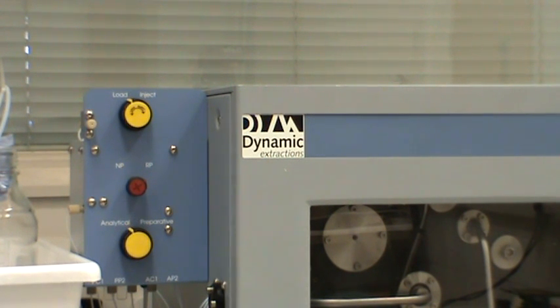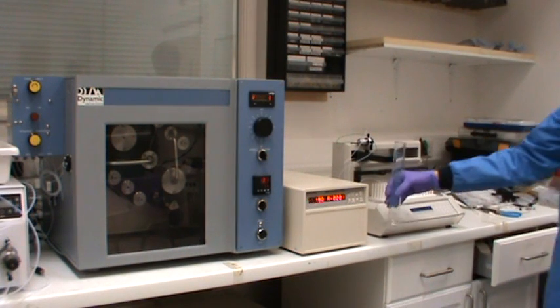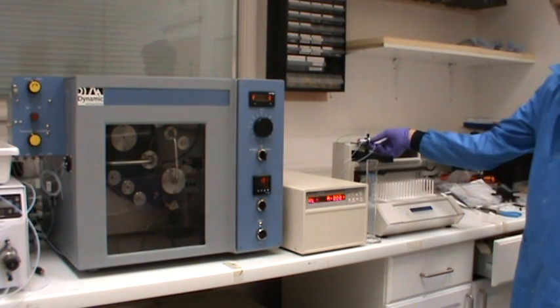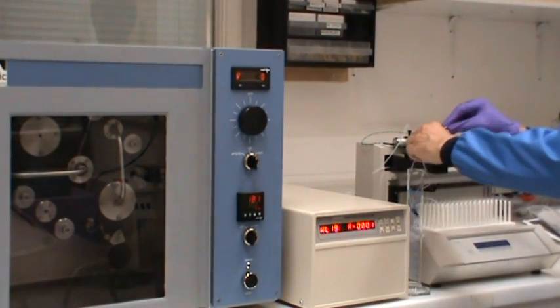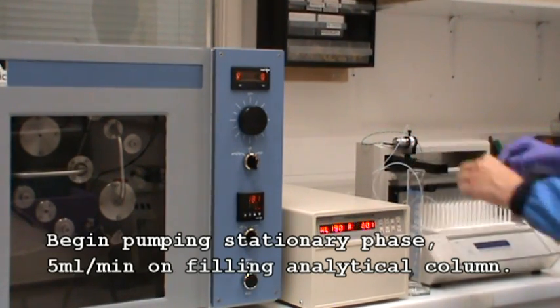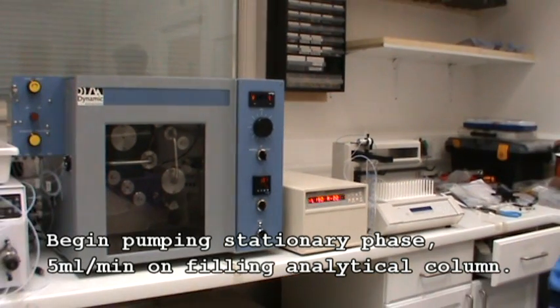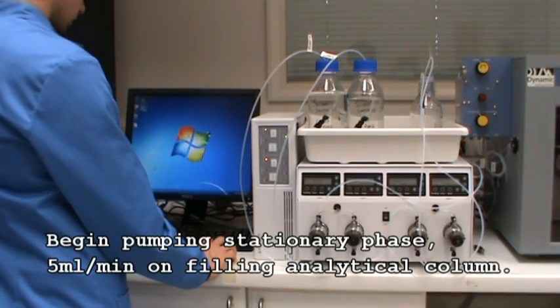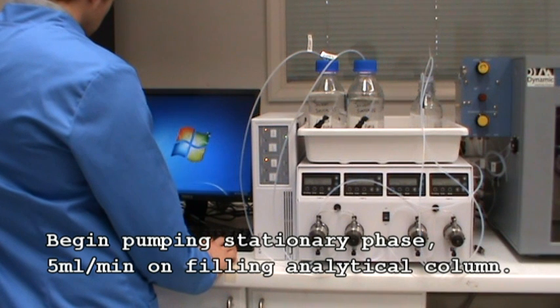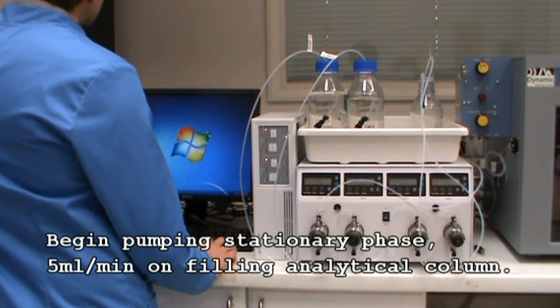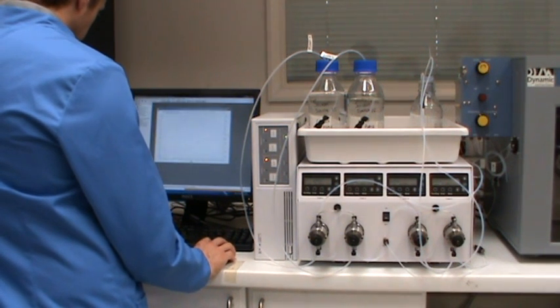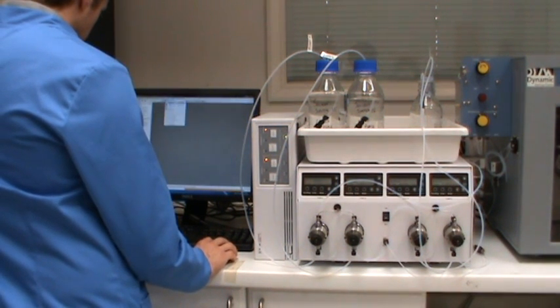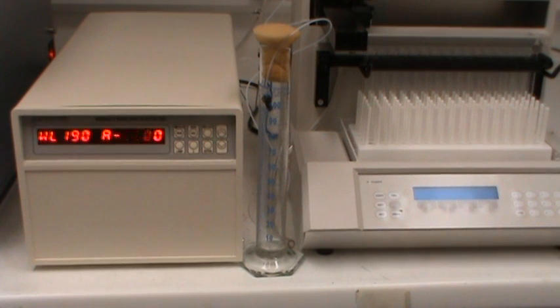Now we need to fill the column with stationary phase. Take the waste stream from the detector and place it in a measuring cylinder. Begin the program on your chromatography software and start to pump stationary phase. As the stationary phase begins to fill the column, any previous solvent in the column will be purged.